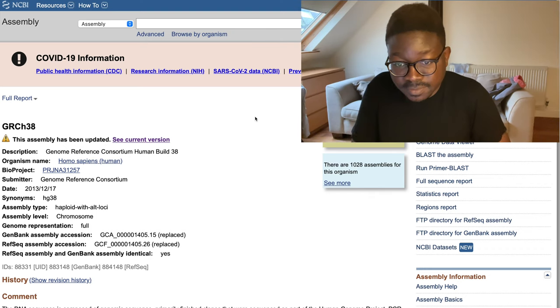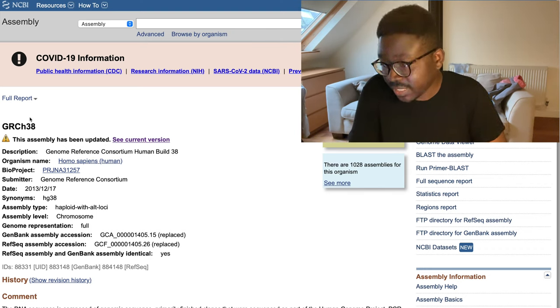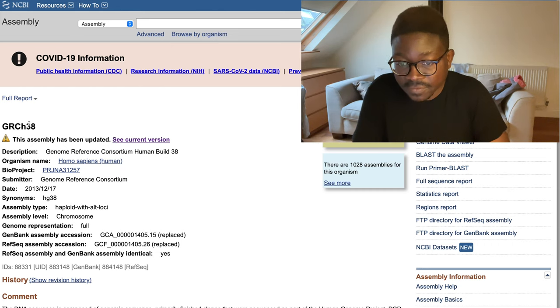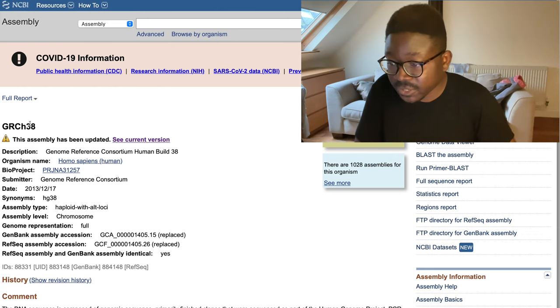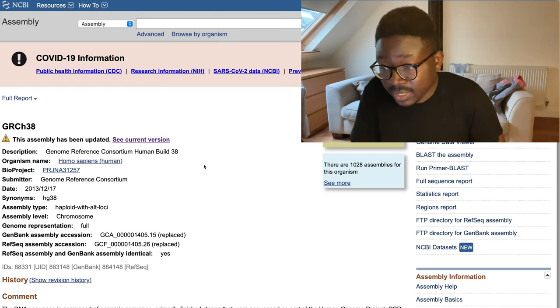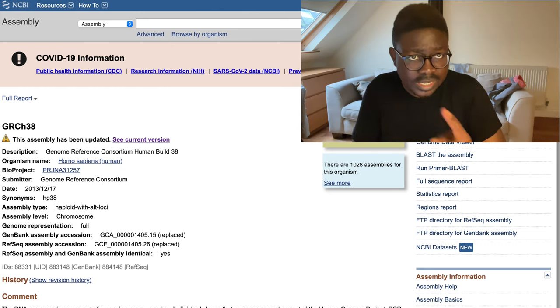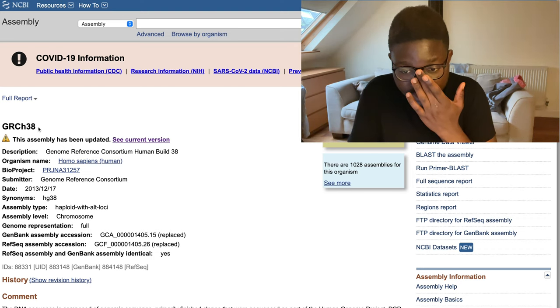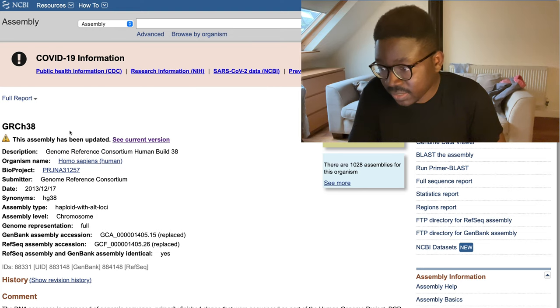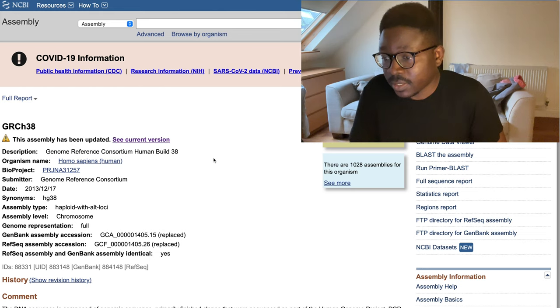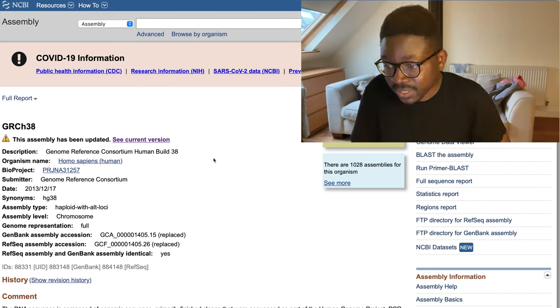If you saw my video last week, you'll know that HG38 is the human reference build you should be using if you have the option — and we do here. So I'm going to be using HG38 as the reference. You can download it from NCBI. We need to do a few things to it before we use it, which I'll talk about next.